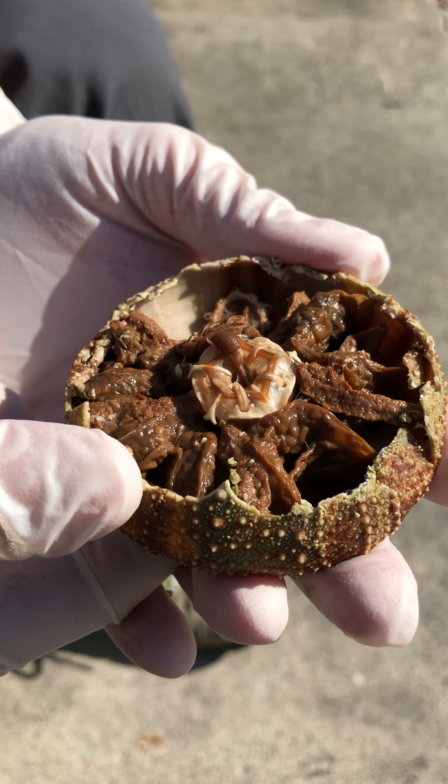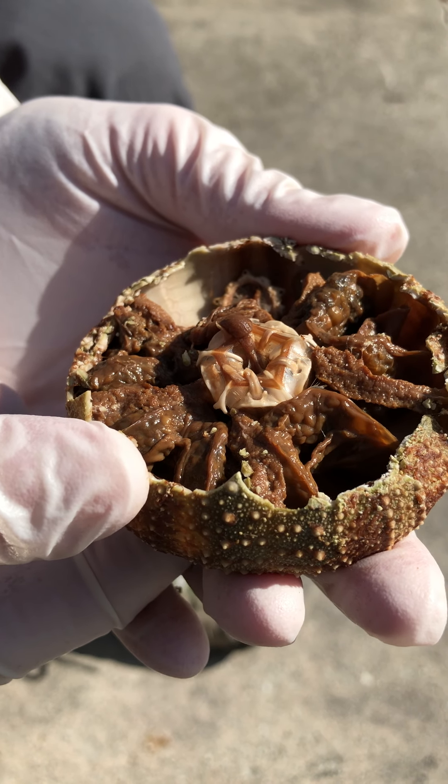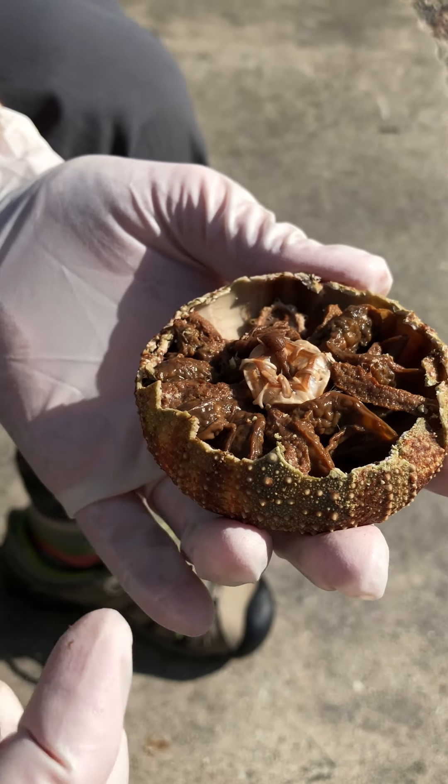You can see that this aboral surface of Aristotle's lantern is continuous with the oral surface — it's part of the same feeding structure.